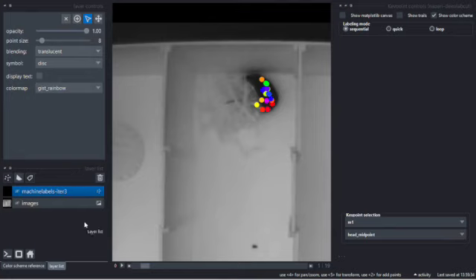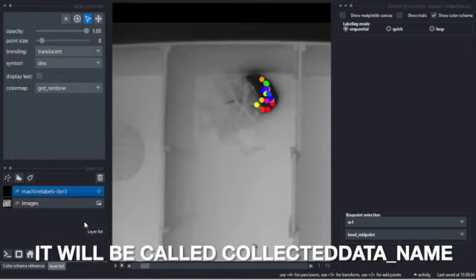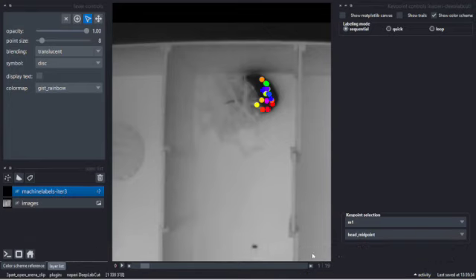It might say something like Roshni labeled layer. So that's fine. This video only has 19 frames, so I could probably do this in one sitting and relabel all the frames and save it. And it's fine if you save it kind of throughout labeling.